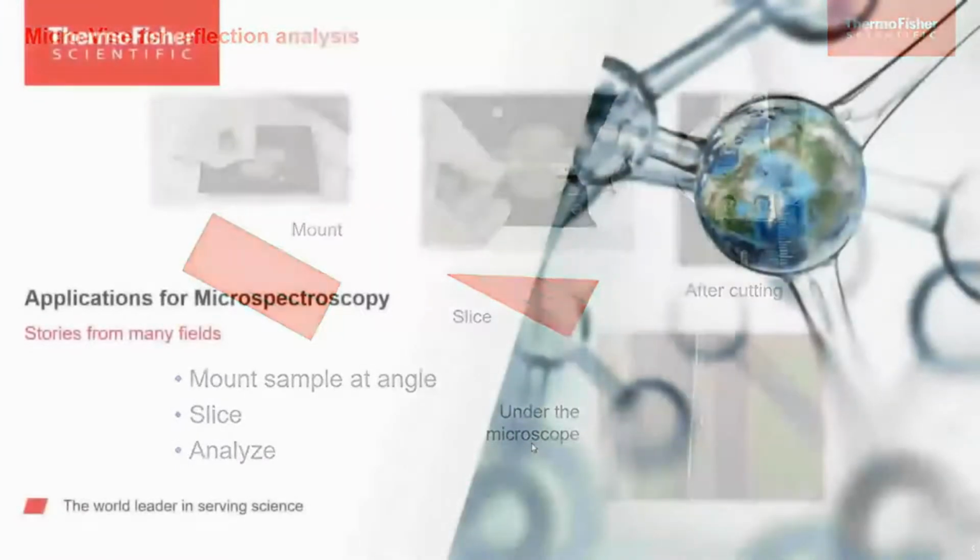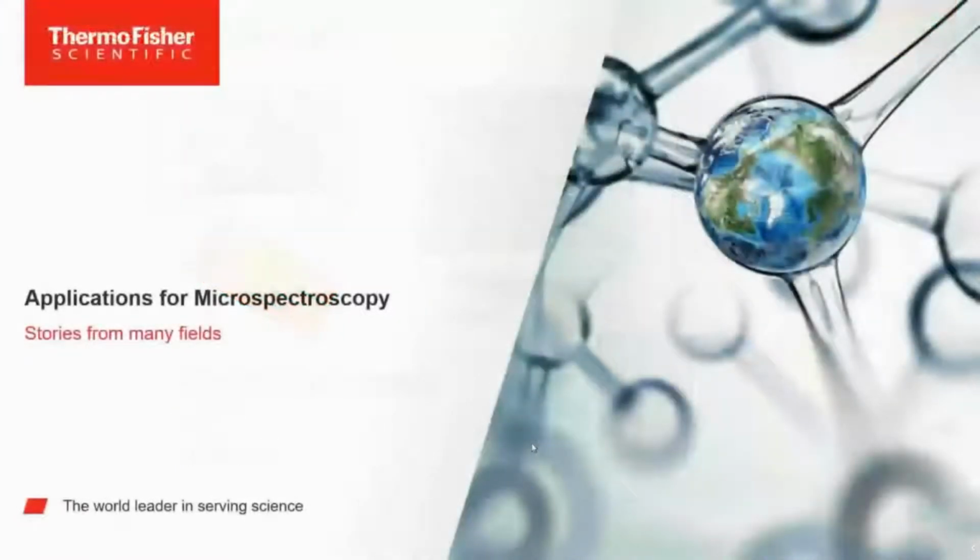Okay, so that's enough about the different preparation tools. There are others. Diffuse reflectance, you basically just stick the sample to a slide and you go to it. That's what I've done with a lot of pharmaceutical tablets. And what I want to do now, though, is step back from that and look at some of the applications that we've recently done and stories from many different fields.